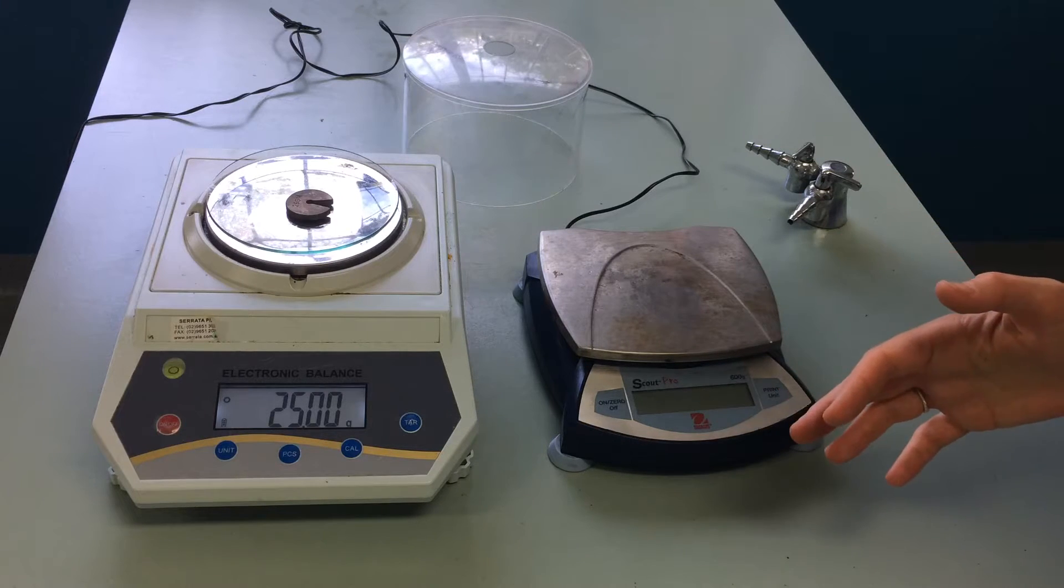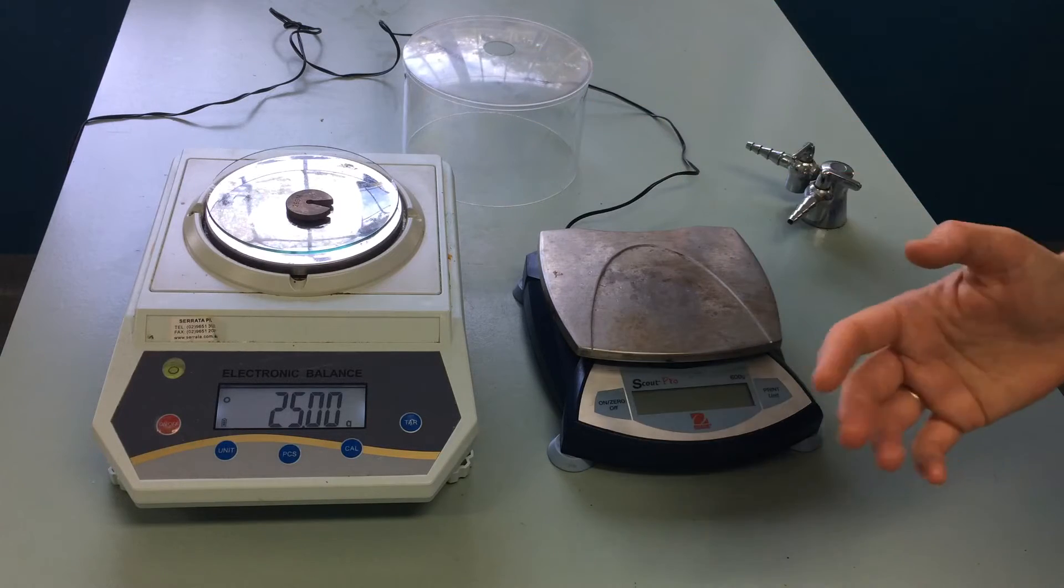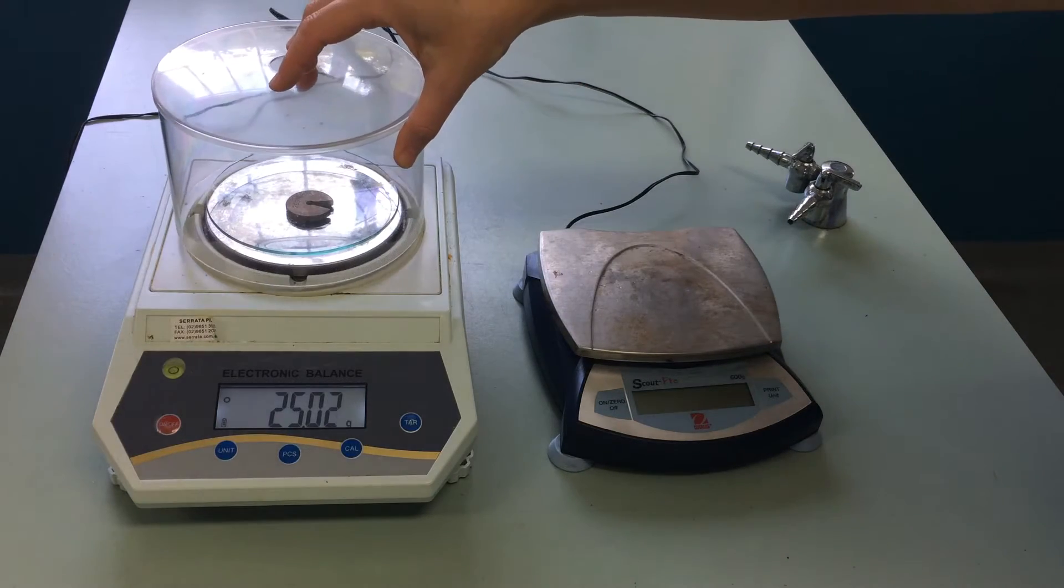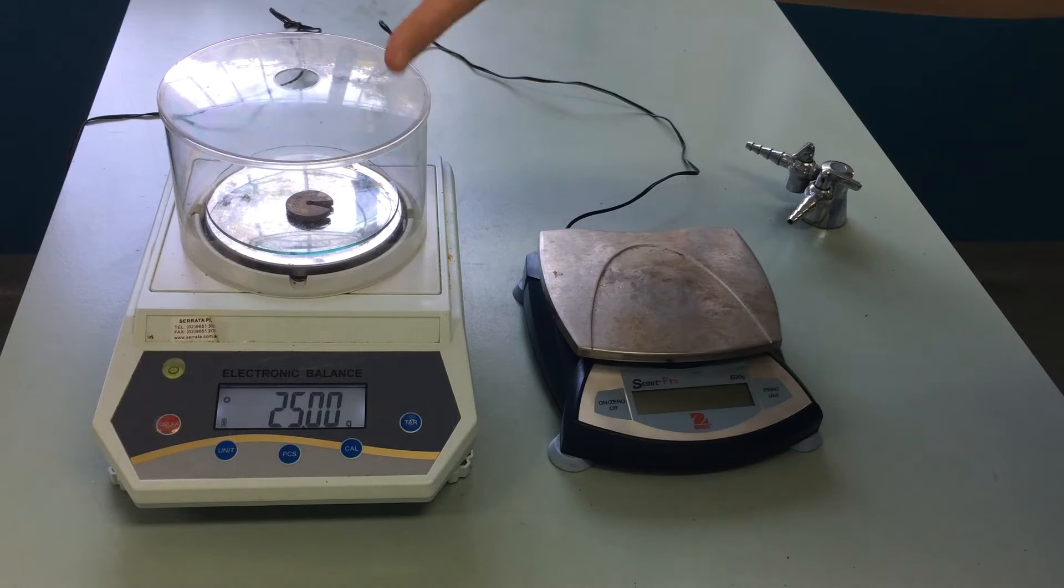Also, some balances are sensitive enough that breezes blowing over them could affect the reading. So if your balance has a lid like this one does, it's always best to place that back on and then take your reading.